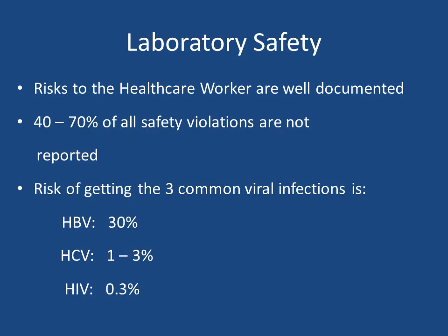Risks to the healthcare worker are well documented. In spite of increasing awareness, 40 to 70% of all safety violations are not reported. The risk of getting the three common viral infections is: hepatitis B virus 30%, hepatitis C virus 1 to 3%, and HIV 0.3%.